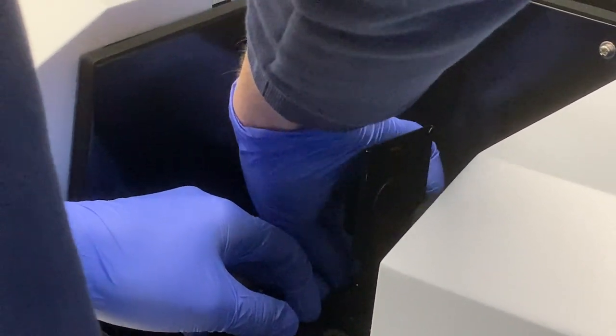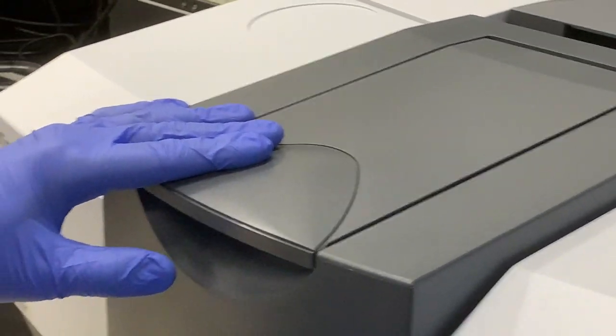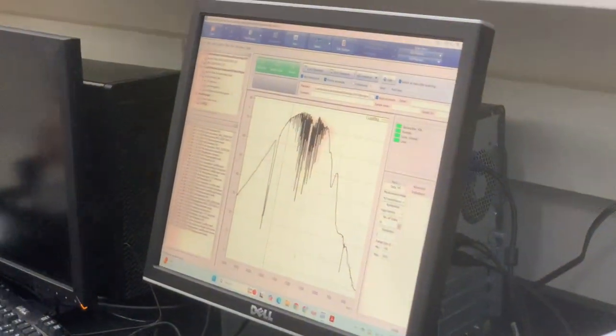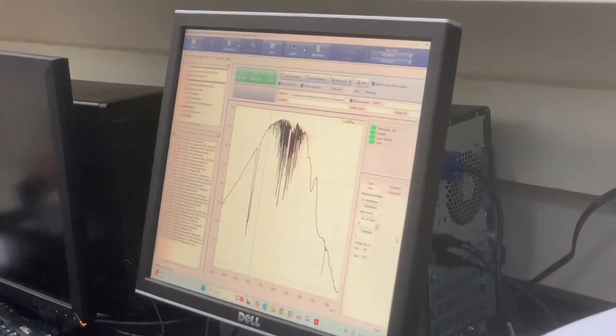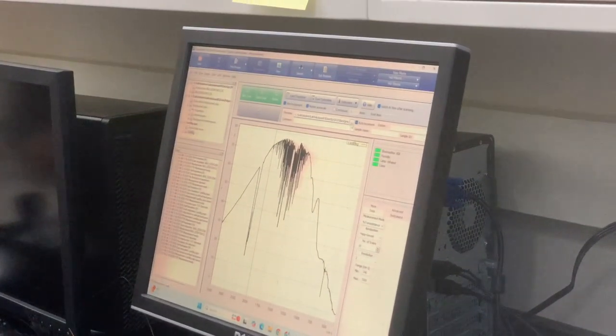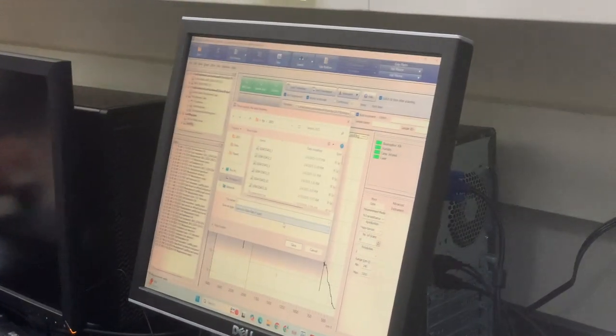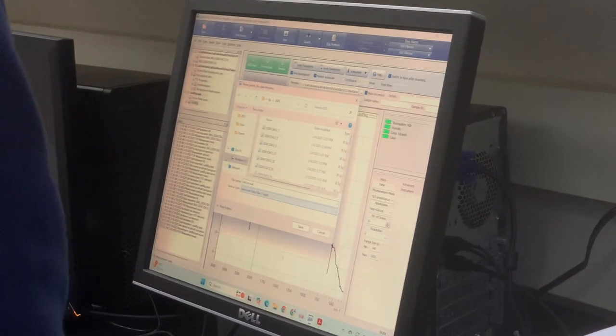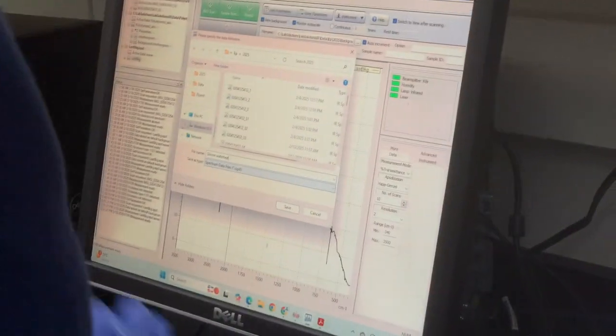May I ask, if you are using this ATR for measuring a silicon wafer, do we simply put the silicon wafer here and we don't necessarily have to push into the small hole here? You want to put the wafer there, and this has to at least make contact. But you will have better results if you have consistent pressure.